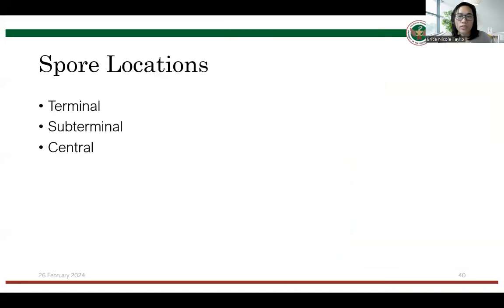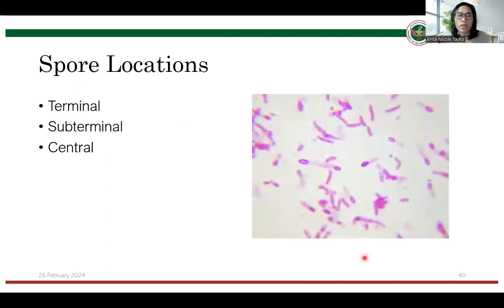So we'll look at some more pictures here. At the same time, let's look at the differences in the spore locations when you try to report your observation of spore locations under the microscope.